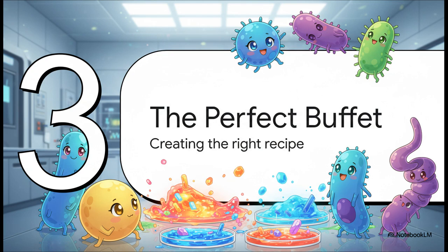Okay, so you've done it. You've isolated a single bacterium. Now what? Well, you got to keep it alive. You have to feed it. And just like people, different bacteria can be pretty picky eaters. This is where culture media come in. We're talking about creating the perfect bacterial buffet.